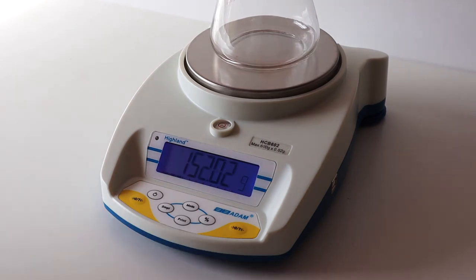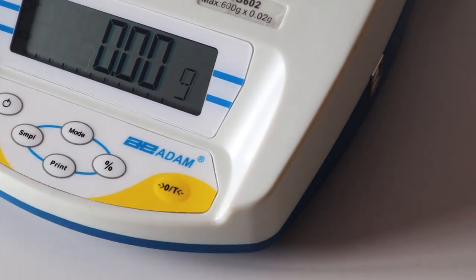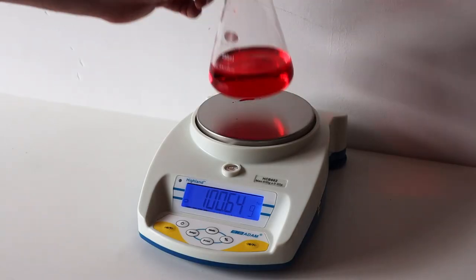To use tare, simply add an item to the balance to tare off, such as a conical flask, and press the T button. Then you can weigh as normal, and the weight reading will show for the contents of the conical flask only.